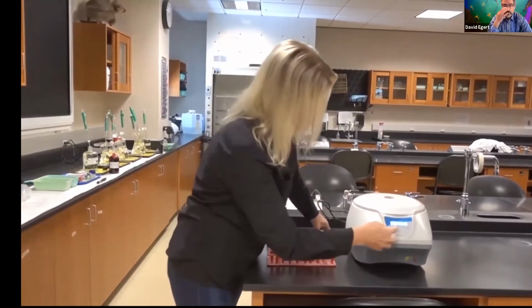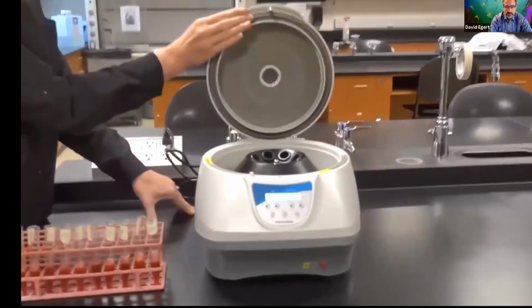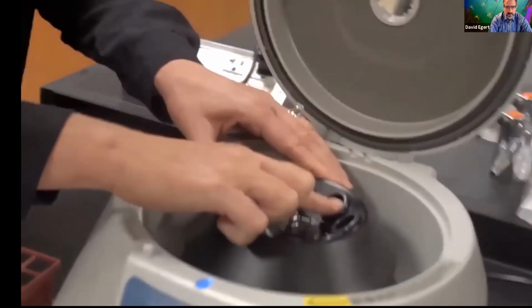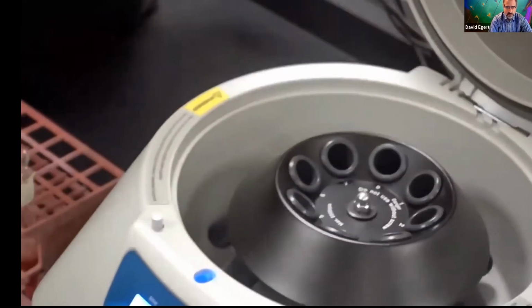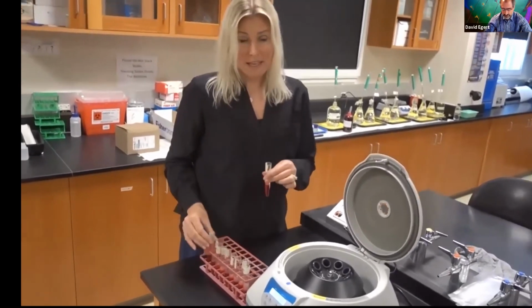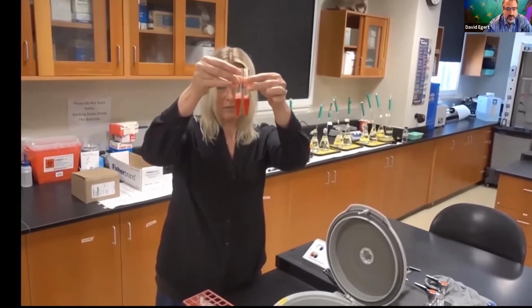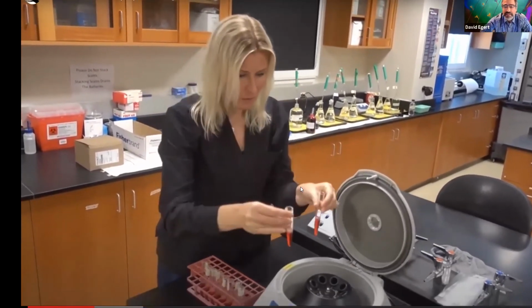All right, so next we're going to press open. If we look inside, there are slots that are numbered, but as David mentioned before, you should label the test tubes, because we're going to have to do this twice. Being organized from the beginning is key. Next, I'm going to make sure once again that everything is balanced, because otherwise this thing will not be happy. Remember those sanity checks?